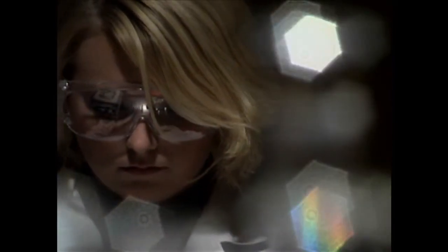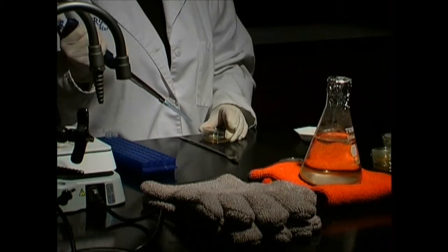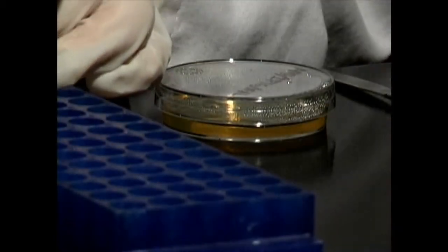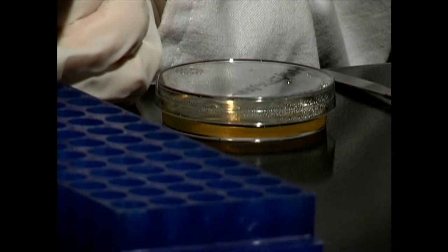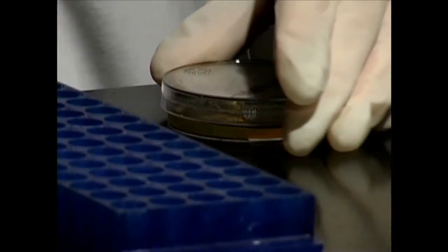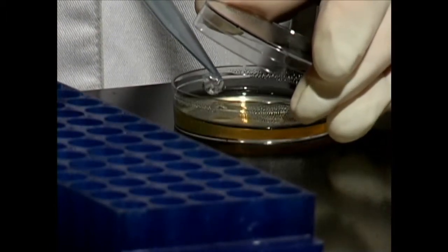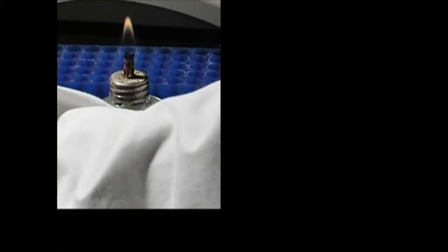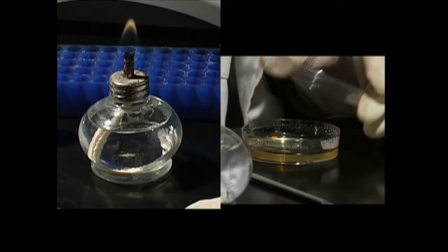Transfer the solution from the control tube to both control plates. Using a fresh, sterile pipette, do the same with the DNA solution. Using aseptic techniques, spread the cells across the plates with an inoculating loop.